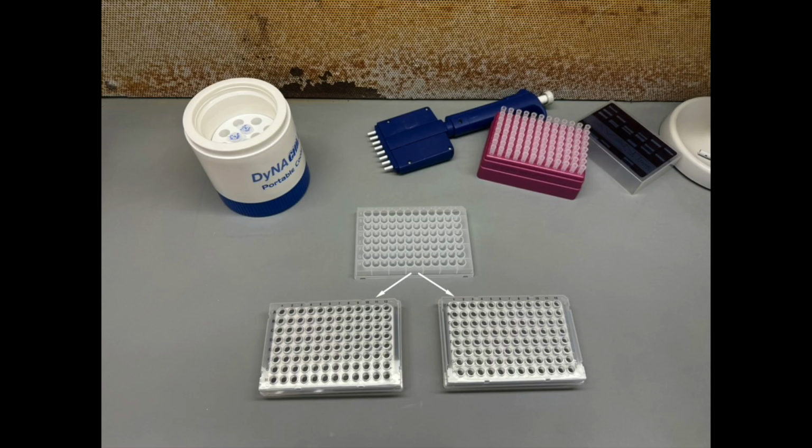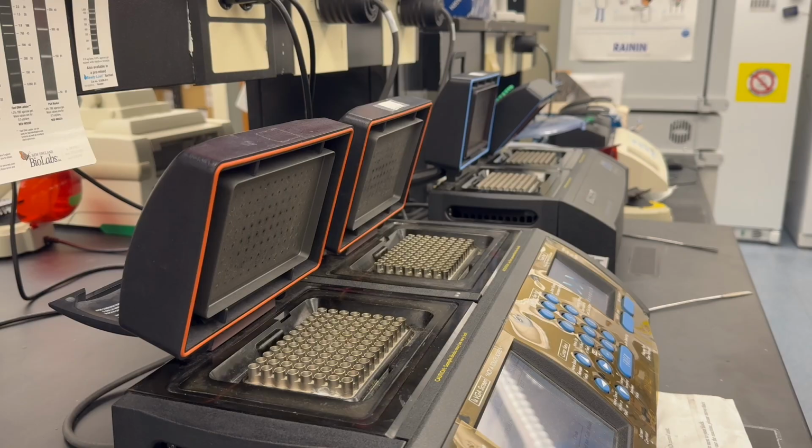Now, I won't take you through the whole PCR setup because all those details can be found in papers, but I will note that I do my PCRs in duplicate. So from the one plate of DNA, I do 2 PCR setups. And with the MiFish primers, with the TruSeq adapters that I've added, I've found it's really important to do the PCR setup as fast as possible and keep everything as cold as possible to prevent primer dimers from forming.